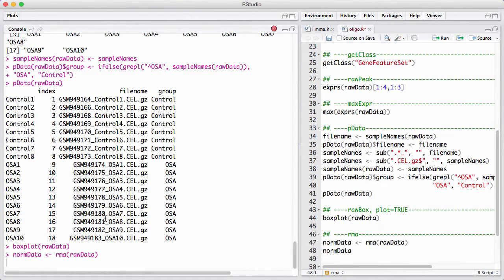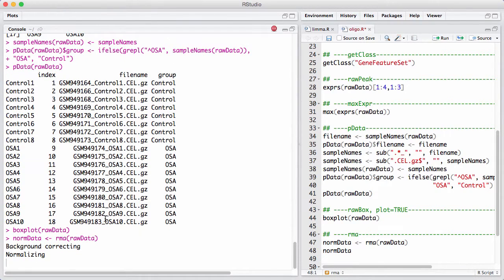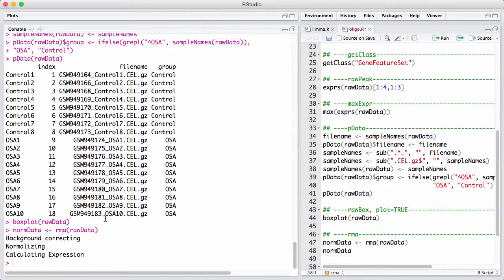It takes a little while, especially because these arrays are quite massive. They have a million probes on them. This is like some of the bigger microarrays that have been built. And RMA consists of basically three steps, as we can see here. Background correction, quantile normalization, and then it takes all the different probes that measure the same gene and output a single number for that.